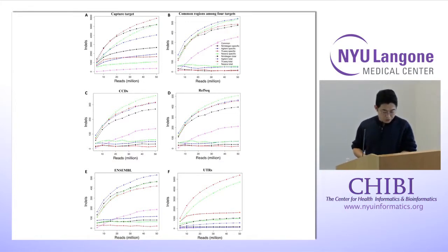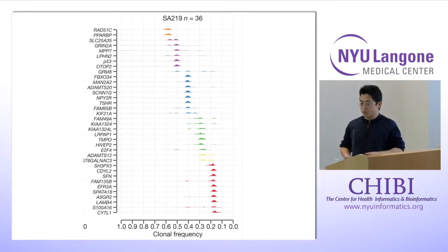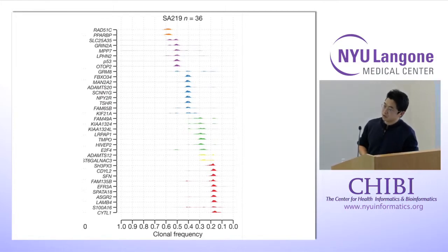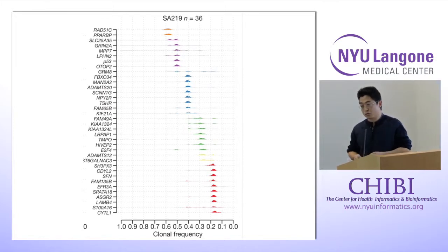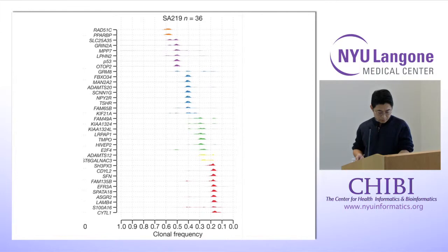With mutation frequency, we can do lots of things. For example, in cancer, in tumor sample studies, looking at tumor heterogeneity, when you look at the frequency of mutations in the driver genes, you can deduce how many clones and subclones are in the tumor samples. This heavily depends on the coverage. The more coverage, and the more very rare mutations you can discover, the more accurately you will deduce the clonal composition of the tumor samples.